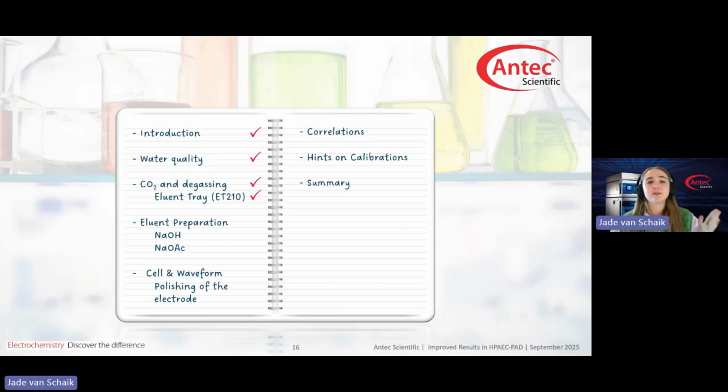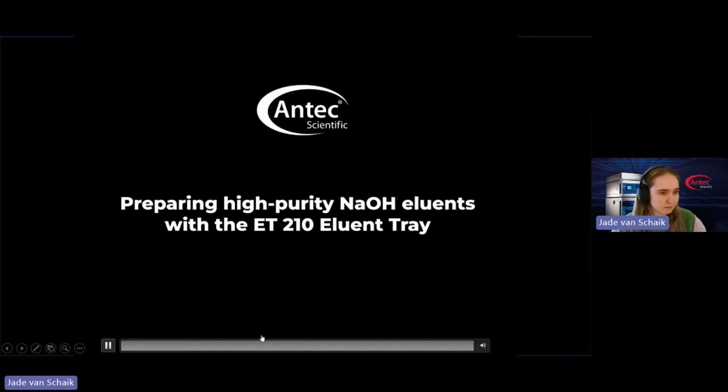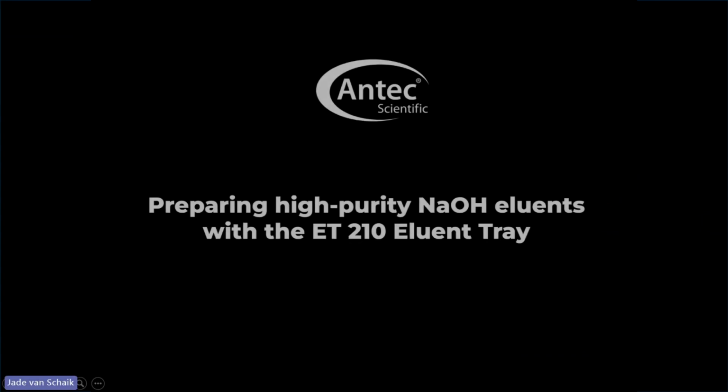So now it's time to talk about eluent preparation and how to handle eluents and reagents. Let's start with preparing sodium hydroxide eluents. As the saying, a picture is worth 1,000 words, suggests, we created a video on this topic. How to use the ET210 eluent tray.